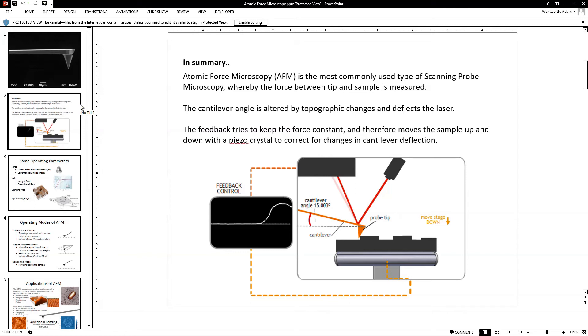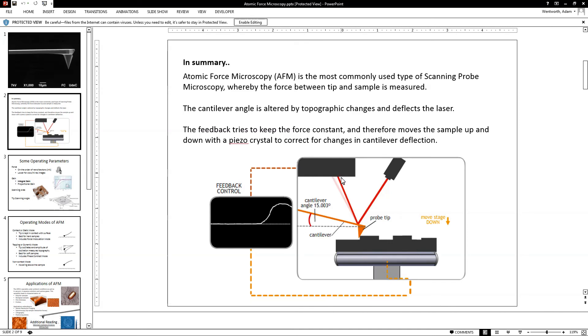So, this cantilever is at a certain angle, and as the tip hits certain features, that cantilever will bend. The laser will therefore be reflected at a different angle, and the piezo crystal is actually in our system mounted above the cantilever, and will respond to this deviation in laser position.